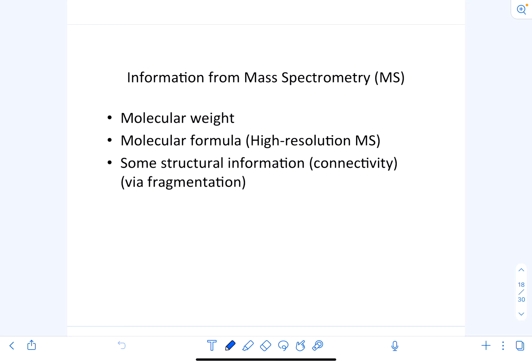All right, guys, we're going to pick up where we left off on Monday's lecture. This is the section on mass spectrometry. So, this is another analytical technique that allows us to learn something about a sample. As the name implies, with mass in the title, the major thing that we learn from mass spectrometry is something that seems pretty simple on the surface, but we actually can learn something about the molecular weight of a compound.